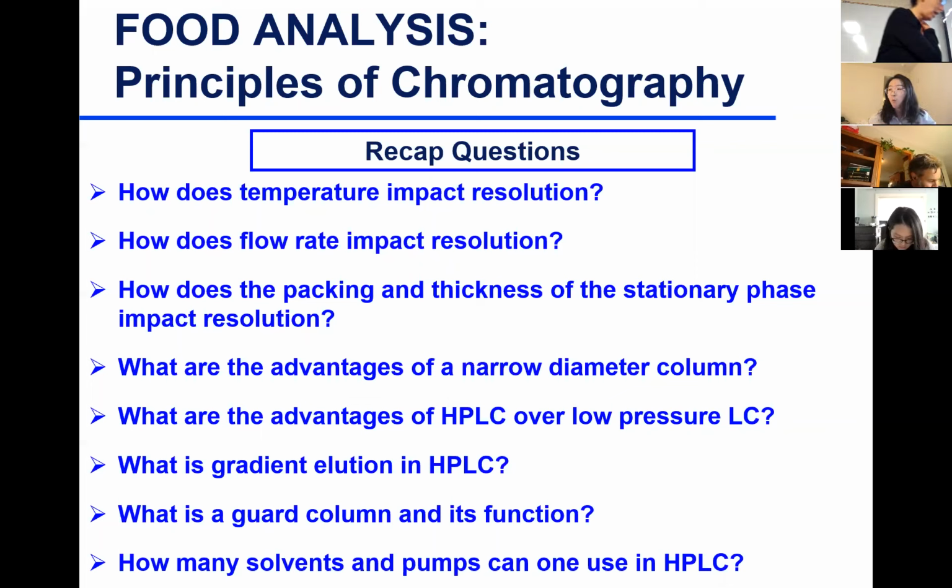You all did the lab already in HPLC, and I showed you the oven, and I mentioned that we have the temperature at 38. So Dan said higher temperature will enhance the resolution. Yes. How does it do that?